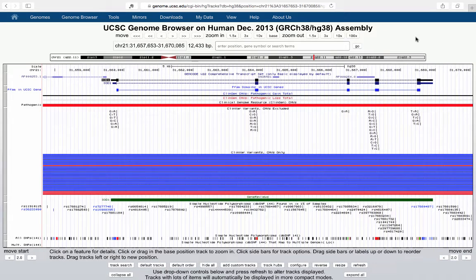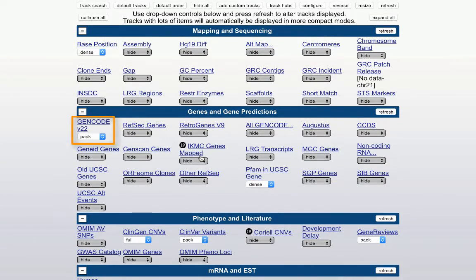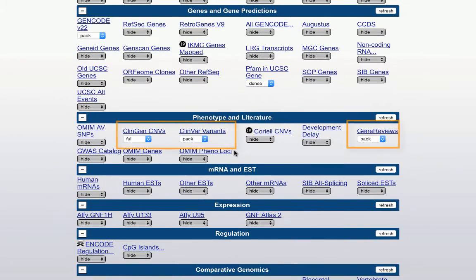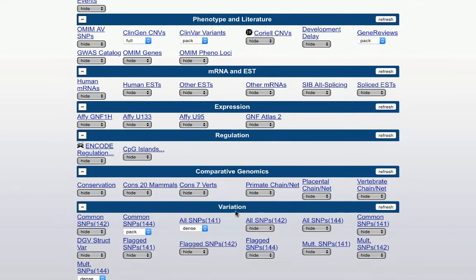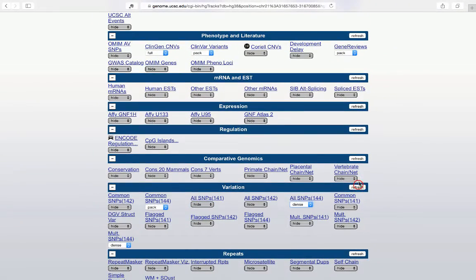In the genome browser I have displayed some tracks that are different than what are normally turned on. I did that by going to hide all, hiding everything, and then only turning back on those I wanted. That includes the Gencode genes, PFAM domains, ClinGen CNVs, and ClinVar variants under phenotype and literature. I've turned on three SNP tracks under variation: common SNPs 144, all SNPs 144, and multi SNPs.